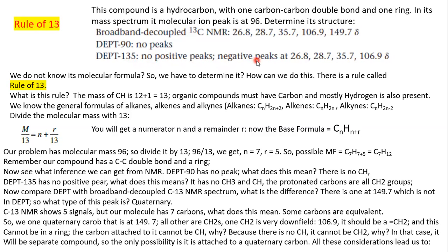In the DEPT, we can only tell about those carbons which have protons, that is the protonated carbons, okay? The proton bearing carbons. So here are the proton bearing carbons. This, this, this, and this. So it means they all are CH2s. They all are CH2s.